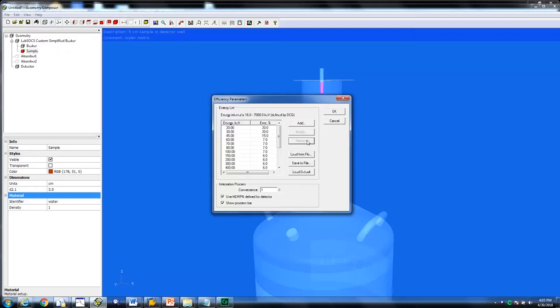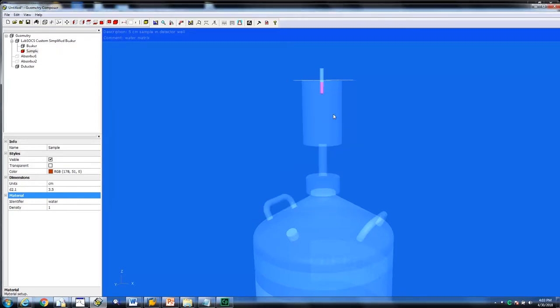There are also errors on the right hand side due to this being part of the laboratory energy list, where they are a little bit tighter than other geometry energy lists. When satisfied with the list, click on OK.